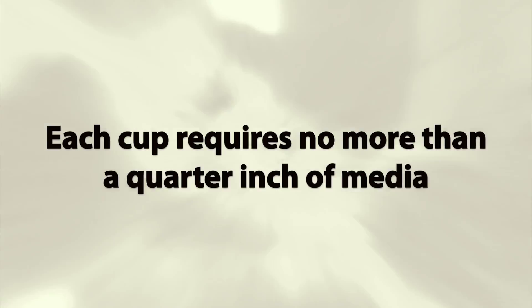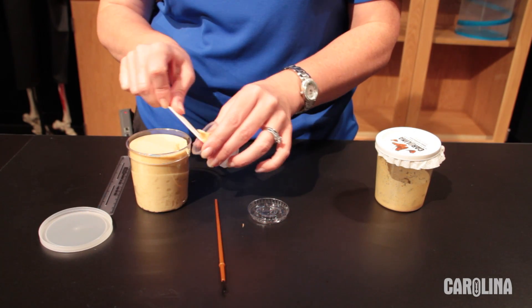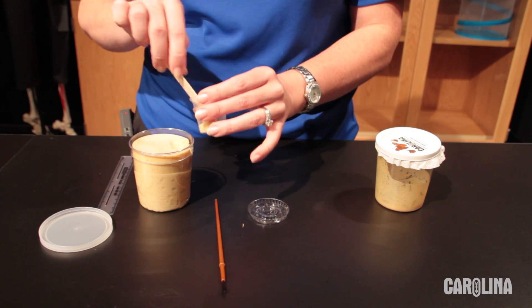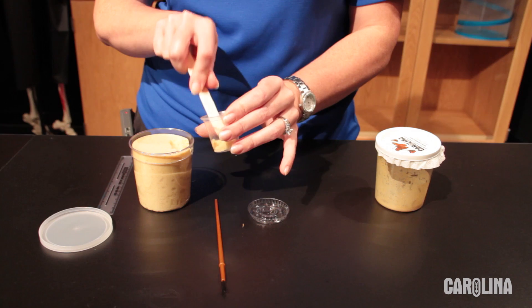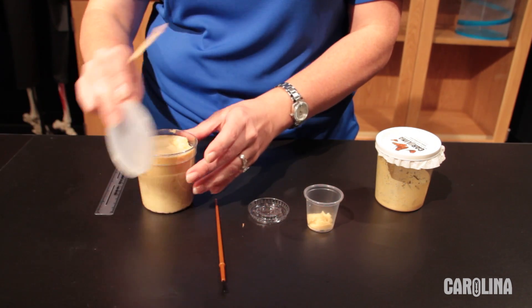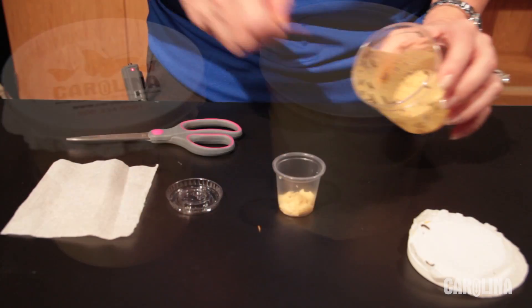Each cup requires no more than a quarter of an inch of media. Too much food decreases the space in which the larvae can move and grow, and it also wastes food. Use a spatula or clean plastic spoon to transfer the media to each cup. Fill all of the cups before adding any larvae to ensure that you are not overfilling. Any leftover food can be refrigerated for up to two weeks.